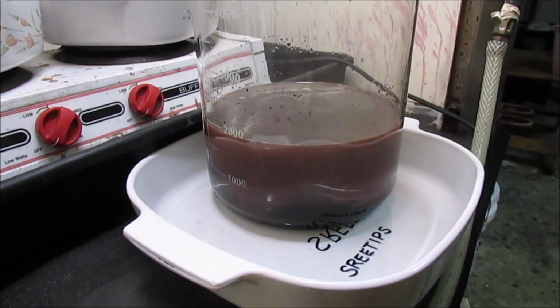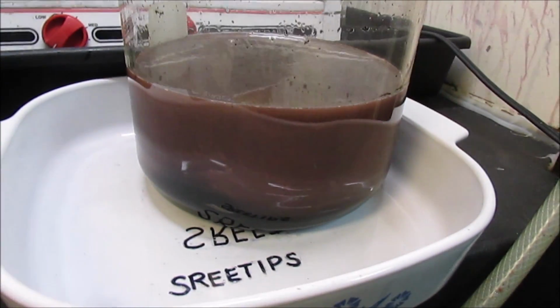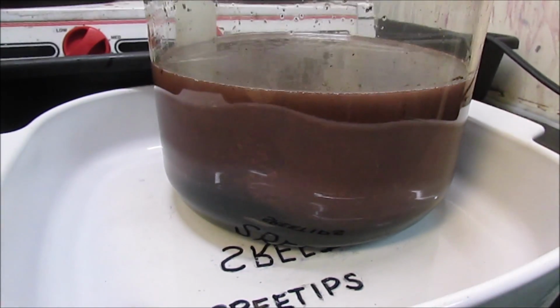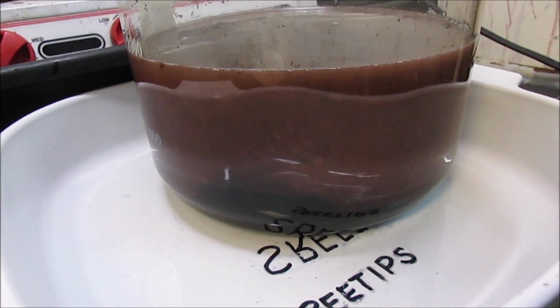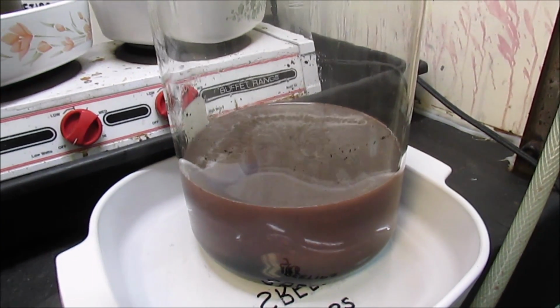This is at the 1 hour point here. The solution is looking pink, burgundy colored, and the metal's still reacting, so we'll just let that go. Continue to let it react.